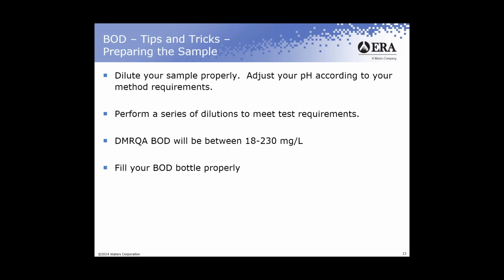If it's too concentrated, what's going to happen is you start adding it dropwise at a time. Your pH will rise slowly to about 4, 4.5. All of a sudden, it's going to shoot up to 10, and you're past your range. Well, then you're stuck adding some acid to the sample, and then it shoots back down. So to avoid that up and down adjustment of the pH, that concentration seems to work real well.